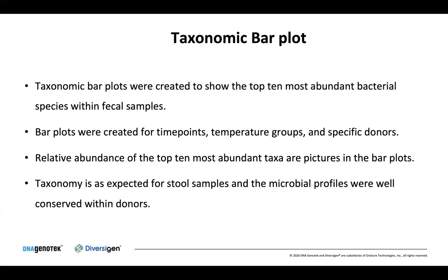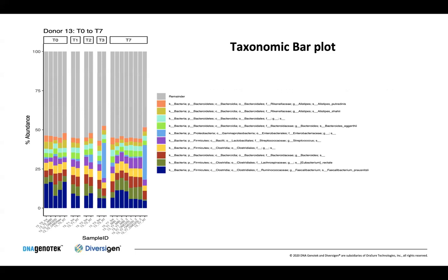Taxonomy is as expected for stool samples, and the microbial profiles were well conserved within donors. Looking at the bar plot for donor 13, we started at T0 and took time points at T1, T2, T3, and T7. At T3 for room temperature, there was a shift in the microbial profile, and we decided to take a closer look to see if these changes were significant.